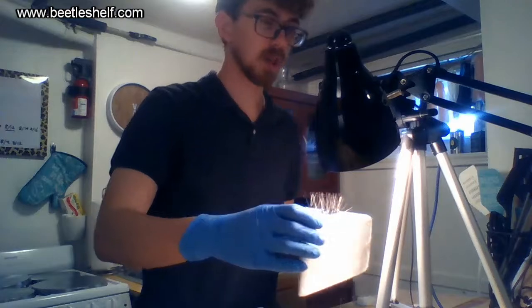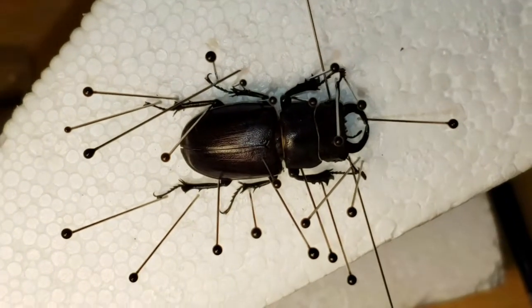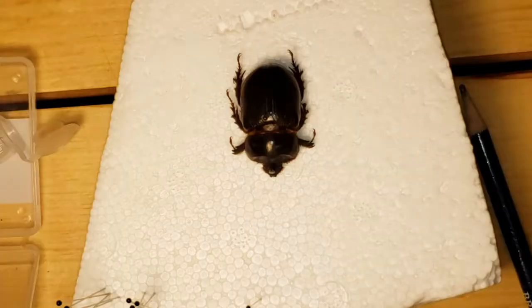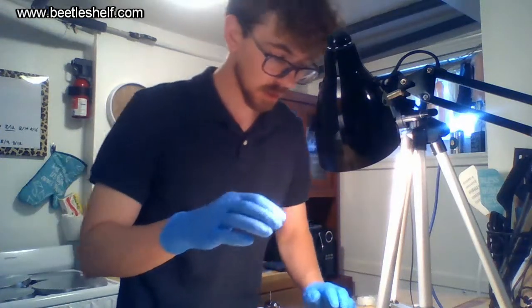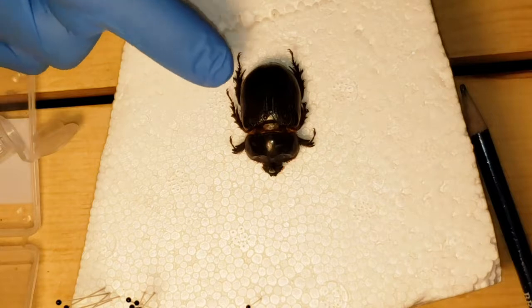I'll show off a pair of Lucanus mazama that I pinned — that's kind of the position we're going for, something like that. Let's go ahead and get started. The first pin you place on beetles is on the top right corner of their elytra.